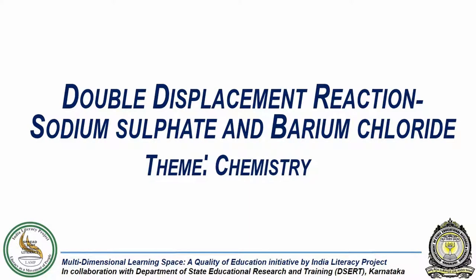In this experiment, we will study the reaction between sodium sulphate and barium chloride.